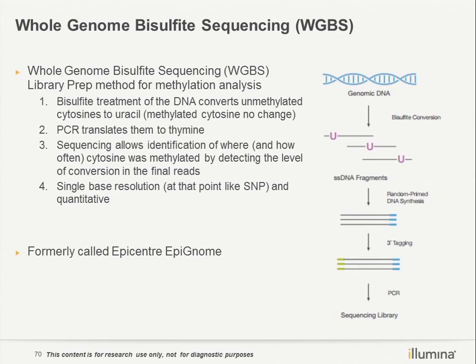And then for the other part, we don't do the bisulfite. Then we can compare the bisulfite-converted sample with the other one. Then we will detect the methylation site, just like a single base variant.